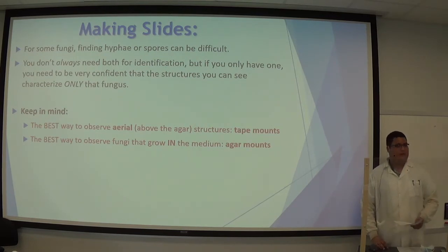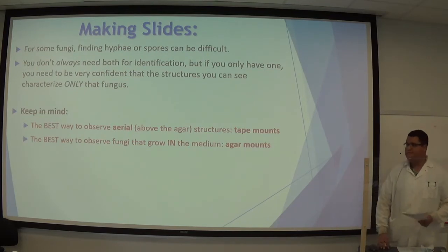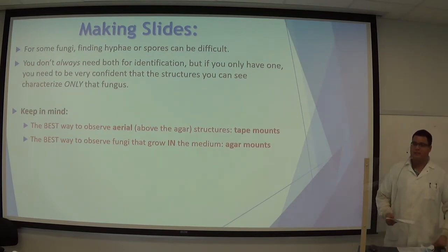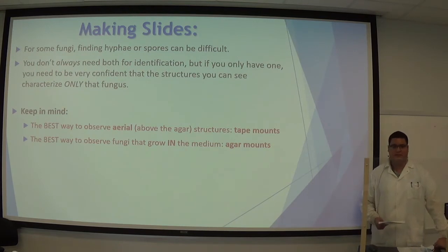Last week, after we finished up all the inoculations, we had a little bit of time to transfer plugs of fungal cultures onto new media. The reason we did that is so we could start growing new mycelia to examine under the microscope today.